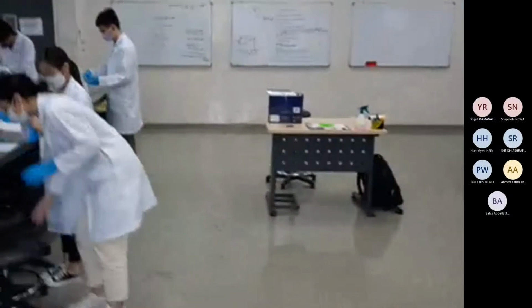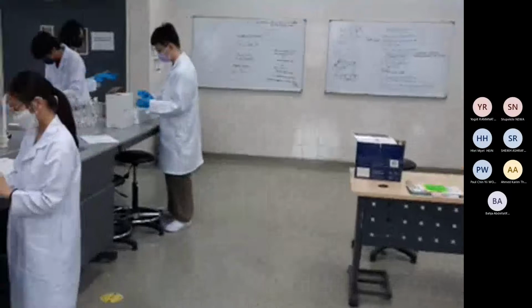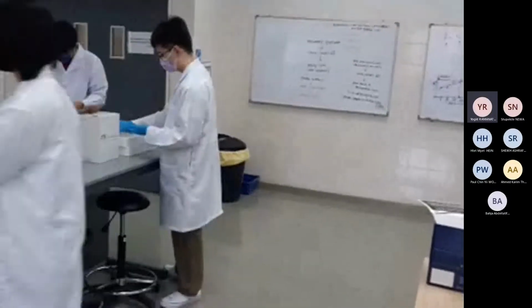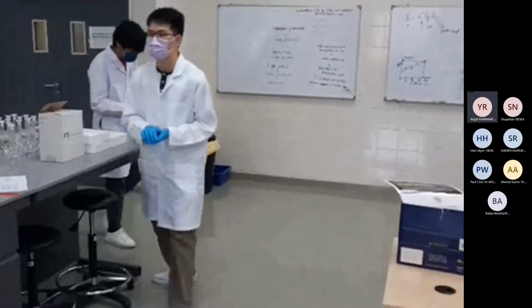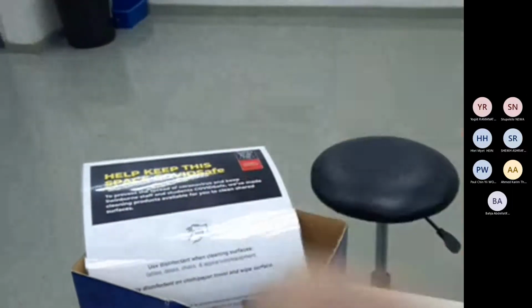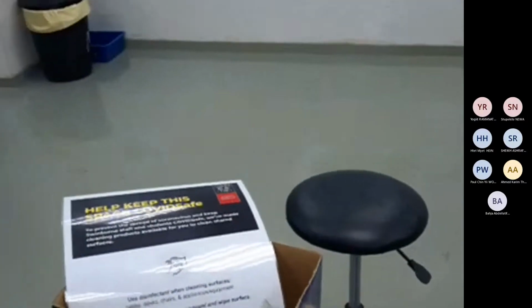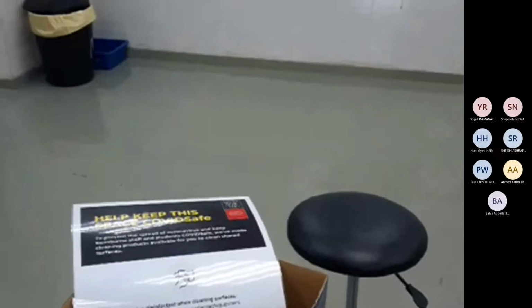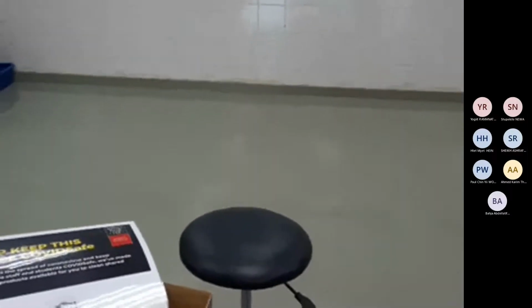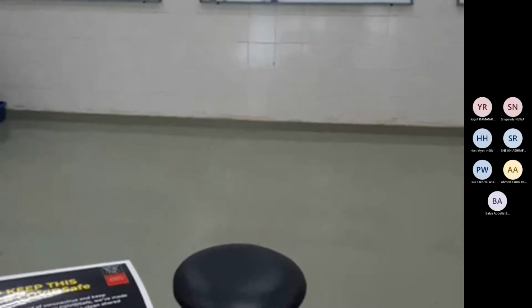So only 2 bands means 2 colors, you say? 2 chromatogram papers. I think they did the result. On the chromatogram, all 3 samples should be there. I think all three samples. That means food dye, then ink, and also the unknown, right?